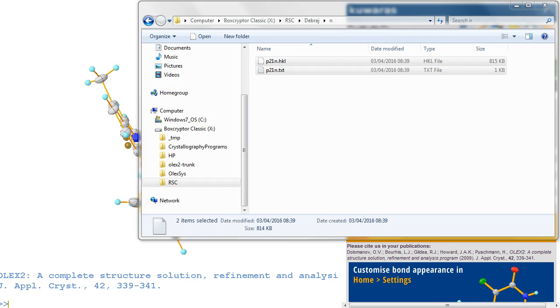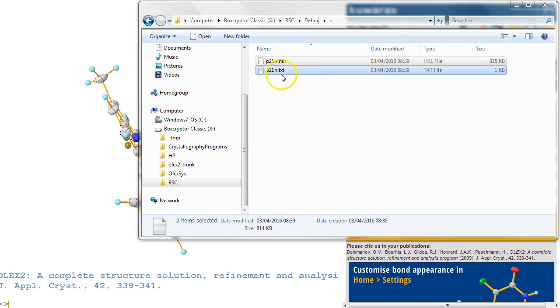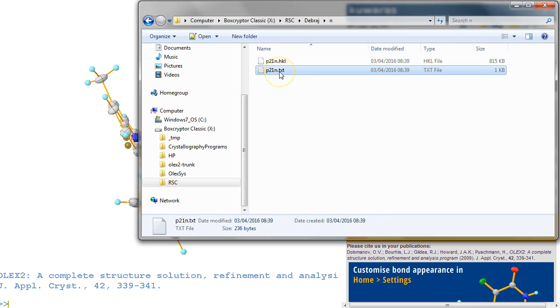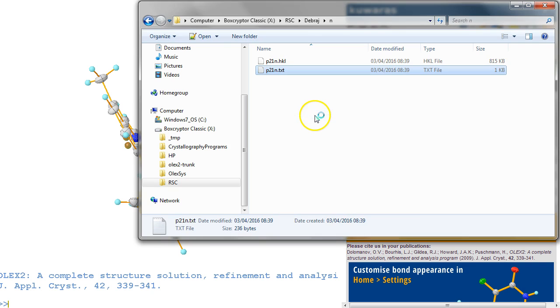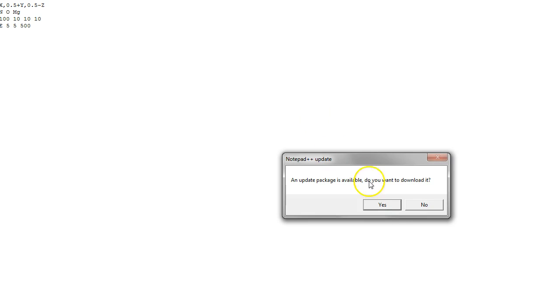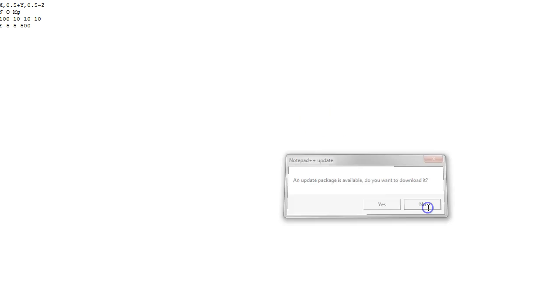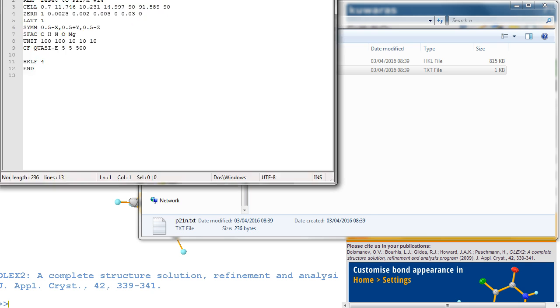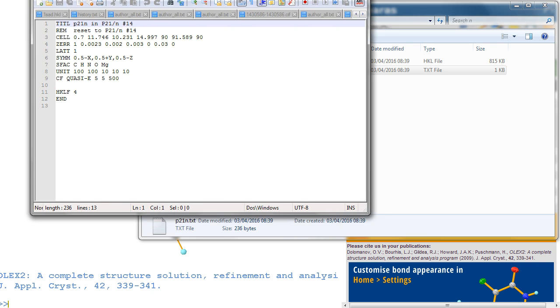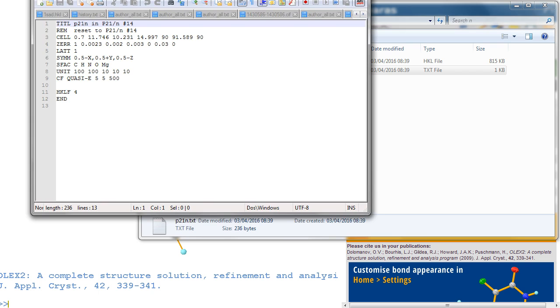Hi there, here's a little problem I've been sent. I got sent an HKL .ins text file, so I wonder what that is. Let's have a look at this text file, open with Notepad++. That's what I use for these things. I will resize this to see what's going on.